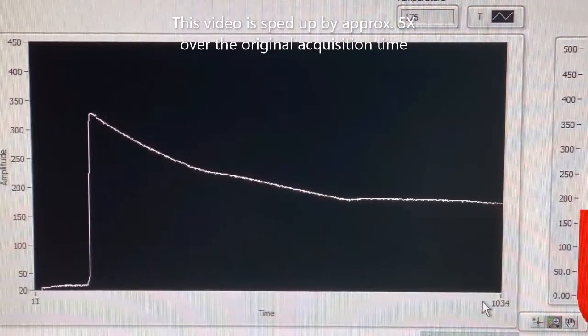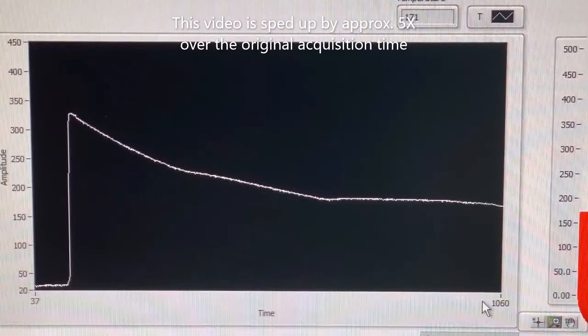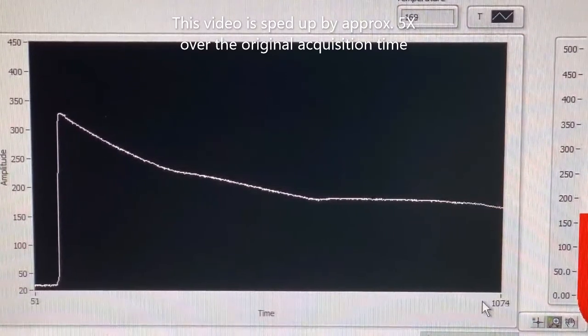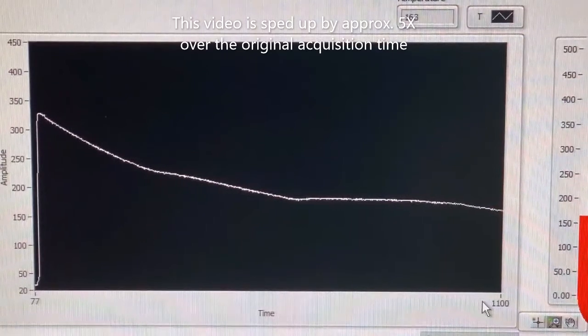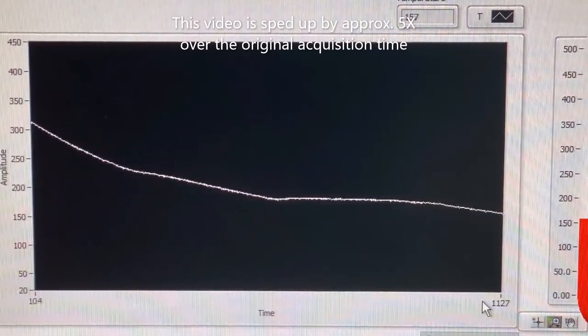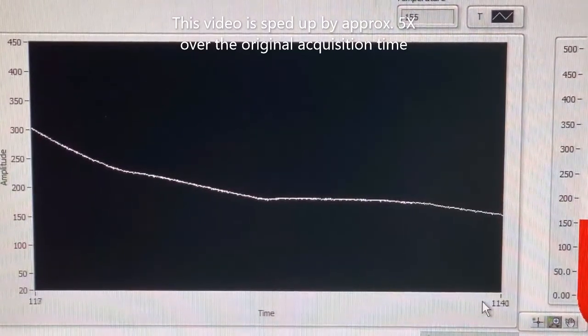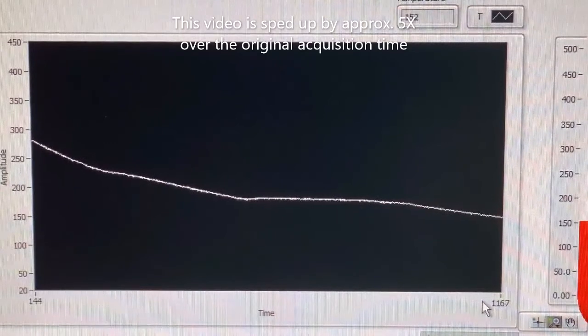At the point when all the heat of fusion has been liberated, as you see here now, the temperature begins to drop again, but rather slowly as this solid now continues to cool towards room temperature. Note the slight decreasing slope of the cooling curve beyond the isotherm at 183.